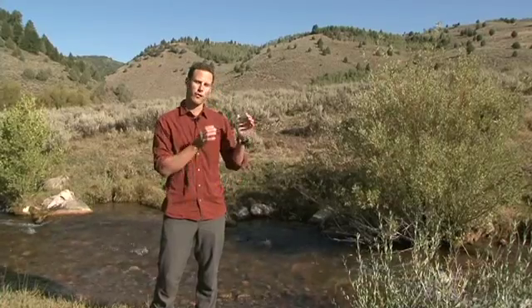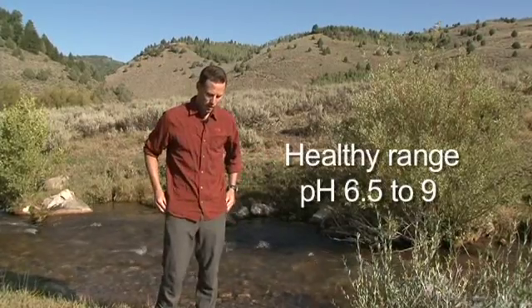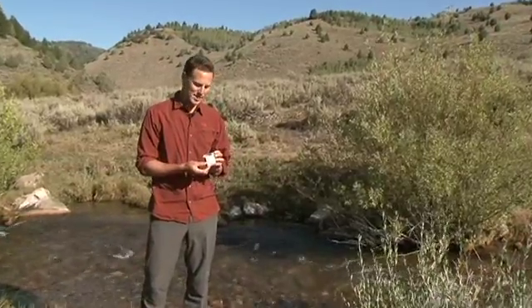In Utah, the legal water quality standards for all beneficial uses are between 6.5 to 9 for pH. For our Tier 1 Utah Water Watch monitors, we use a litmus paper test that is on a scale from 5 to 10 pH. We'll show you how to measure this now.